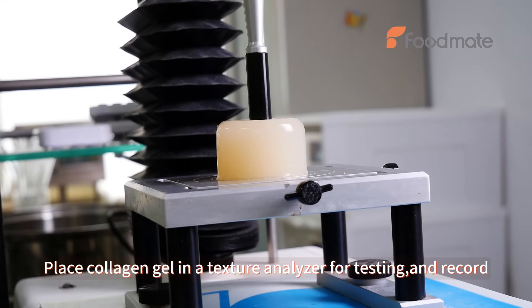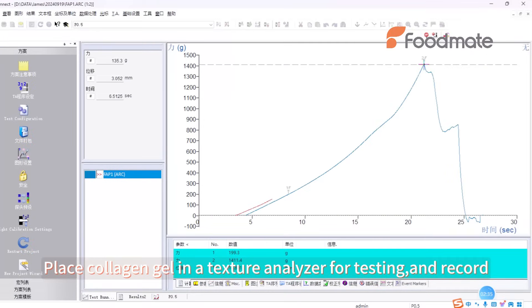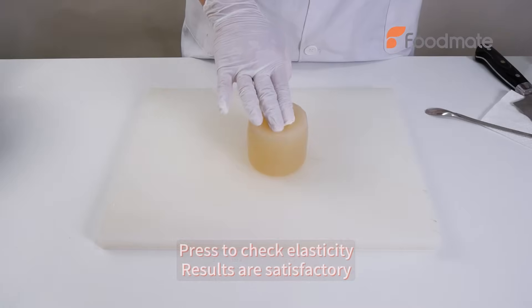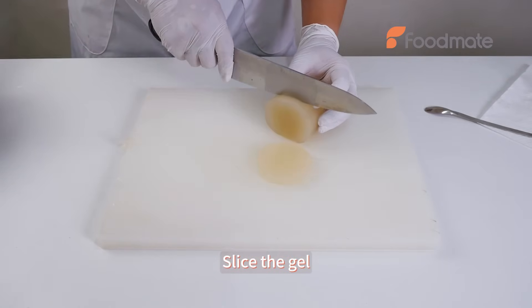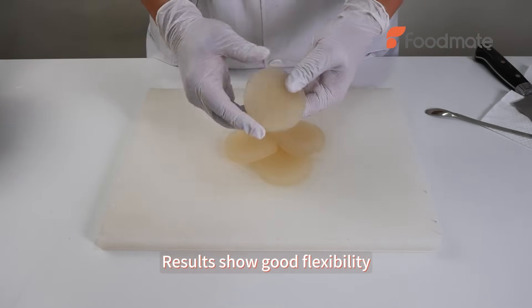Place collagen gel in a texture analyzer for testing and record. Press to check elasticity — results are satisfactory. Slice the gel. Results show good flexibility.